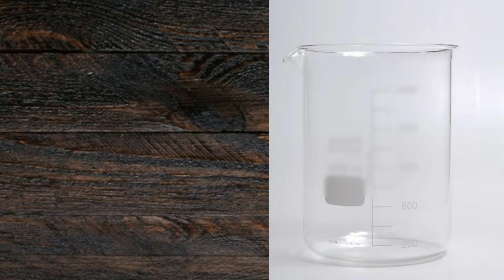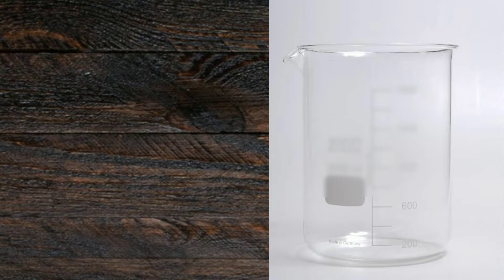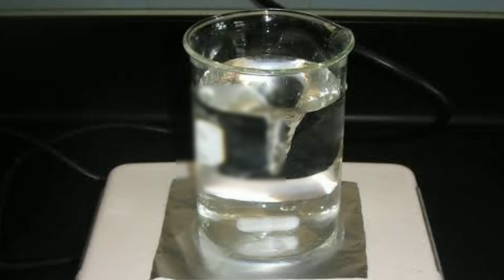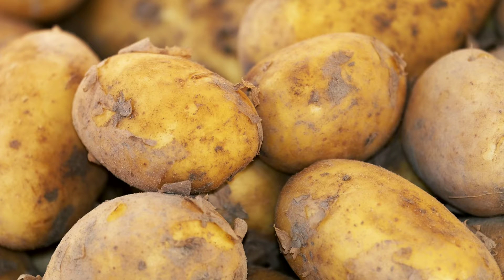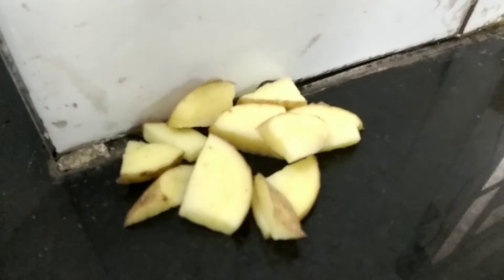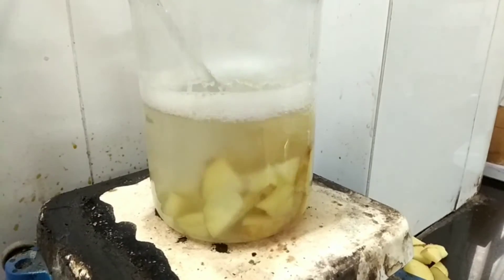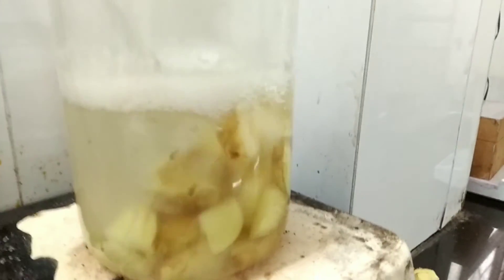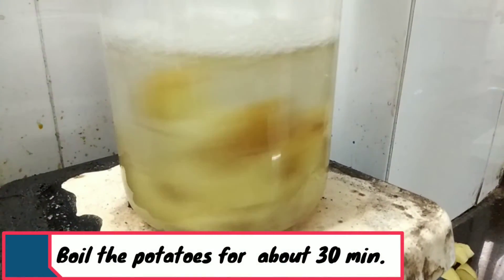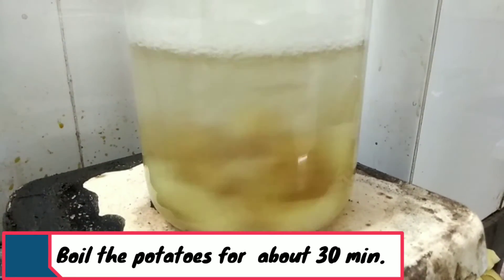First, we have to take a large beaker of about 1500 ml, fill it with 1000 ml of distilled water, and put the beaker on a hot plate to boil the water. After that, take 200 grams of potato, wash them properly, and chop them into small pieces. Then put all the potato pieces into the boiling water and boil for 30 minutes until the potatoes soften.